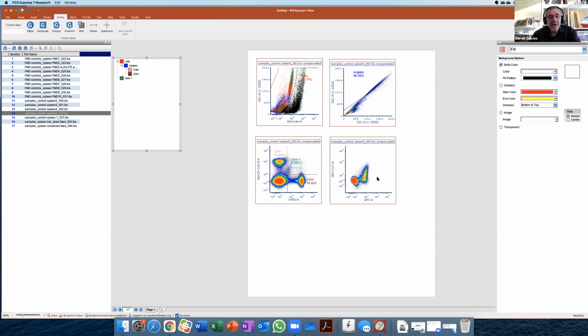But while we're at this point, there's another couple of questions here, and before we get too far away from the FMO, there's a question here asking, if you've got those 100 clinical samples, could you take a bit out of each of them and use that as a sort of combined FMO? Yeah, I mean, it's one of those things.